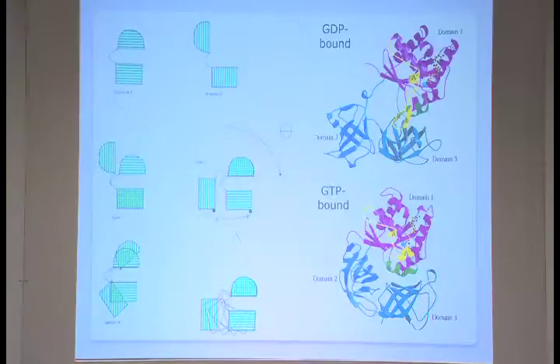Say this is elongation factor Tu, EF-Tu, as we call it. The yellow one you see is the switch one region where GTP binds. This changes from the GTP to the GDP state, from about a 3-10 helix, I think, to a beta sheeted structure. Can we see that kind of change? We cannot, probably not even at 4 angstrom. It needs to be much better than 3 angstrom to even model this.